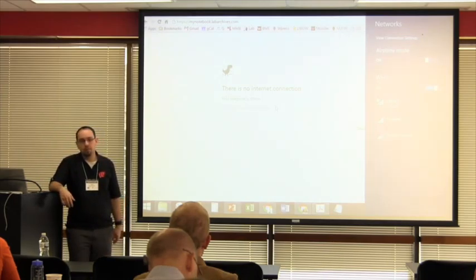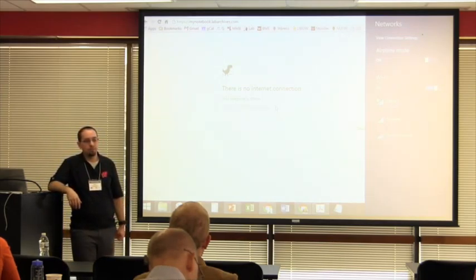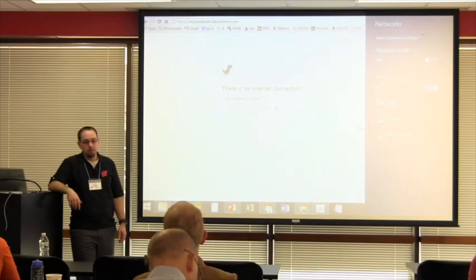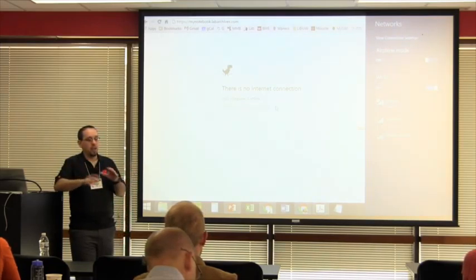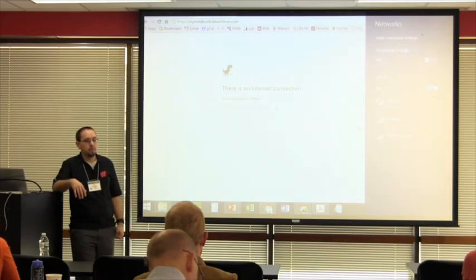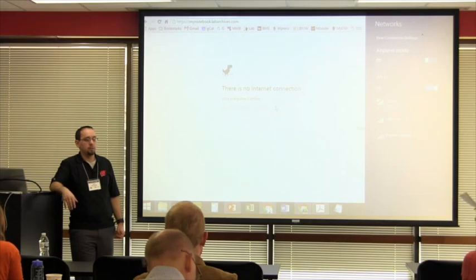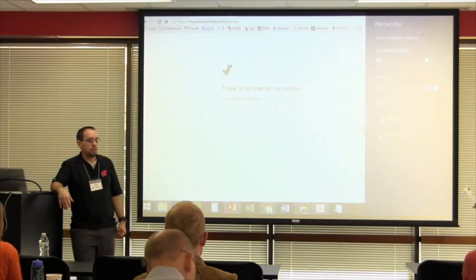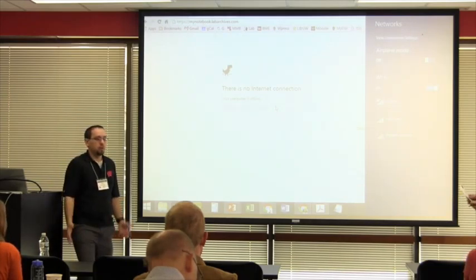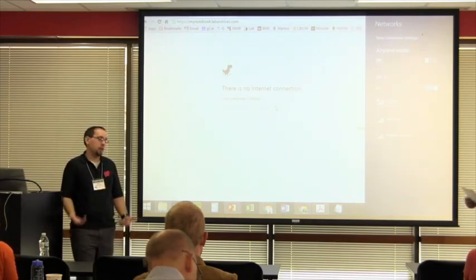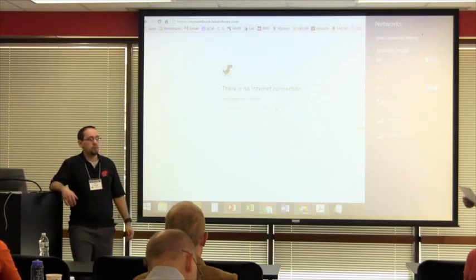So maybe let's go into the demo now and have you guys play around with it — you can kind of see how that works. But what they'll end up doing is they'll just open a page and they can edit right in there and answer the questions that we have for them. Right in real time. They can fill in the blanks in real time, right within the lab — whether it's on their phone, on their iPad, or in a browser like this.